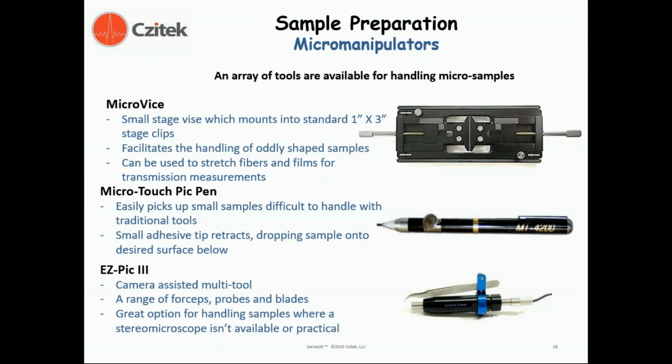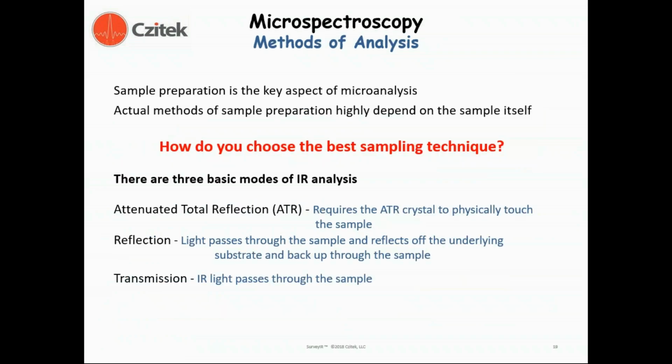If your hands are not steady, there are various micro manipulator options that incorporate imaging as part of the micro manipulator. Very expensive solutions along these lines are available that completely automate the process of moving and transferring samples, and can be used to transfer extremely small samples.